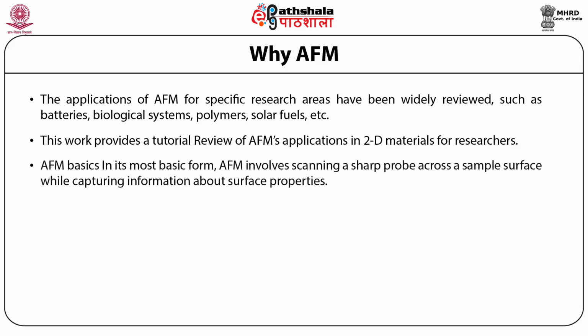AFM basics. In its most basic form, AFM involves scanning a sharp probe across a sample surface while capturing information about surface properties. An AFM probe is composed of a substrate, a cantilever, and a sharp tip.